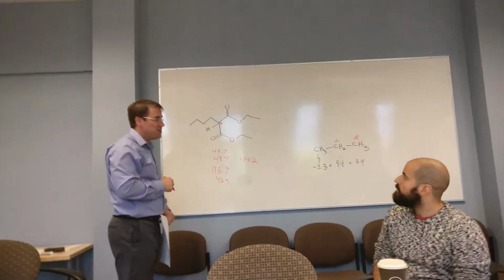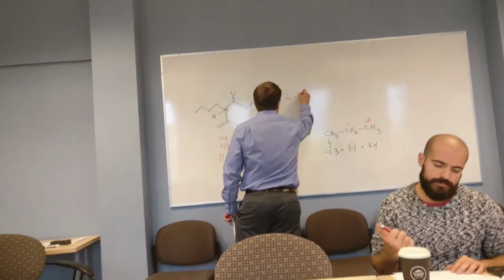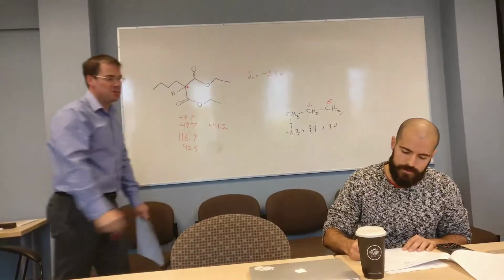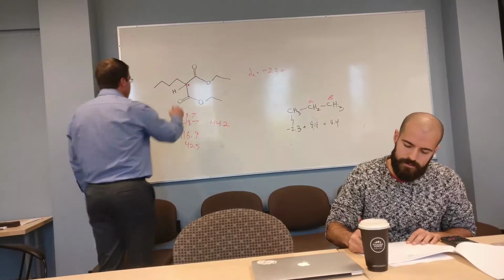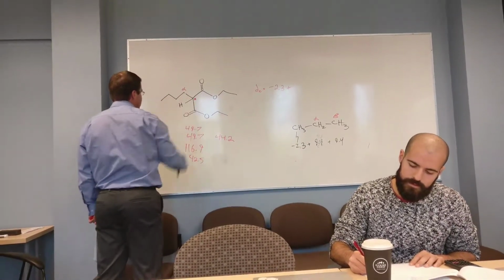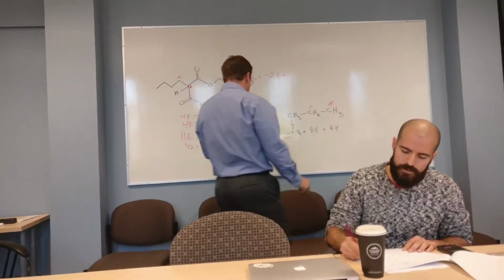What's at the alpha position? So we're at minus 2.3, plus, let's count up alpha substituents first. What's at the alpha position? An alkyl chain. Yeah, so there's a butyl group, right? 1, 2, 3, 4 carbons. So that alpha butyl group is worth 9.1.